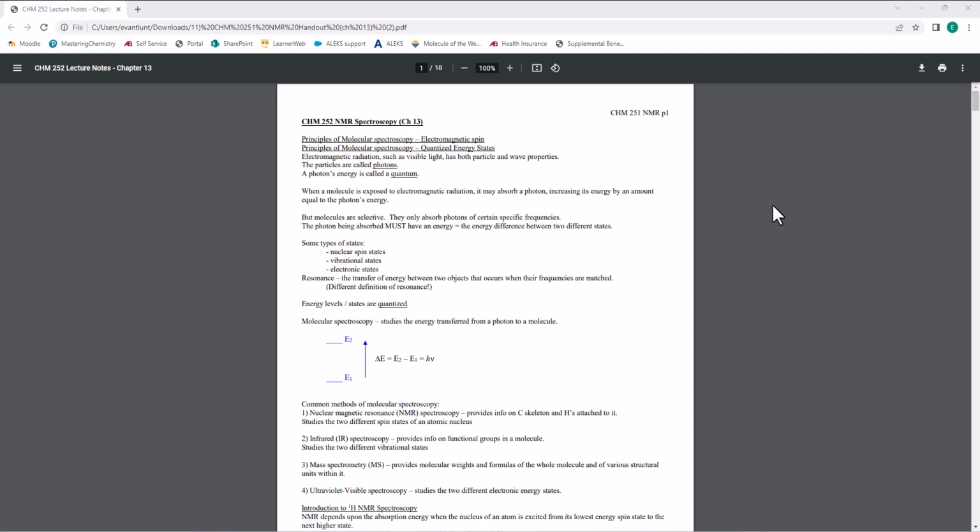It's very, very powerful for a lot of different reasons, and often at the end of a reaction, we'll take an NMR of a product to really decide whether we have pure product, what we made, and if there are any side reactions that happened that we didn't want.